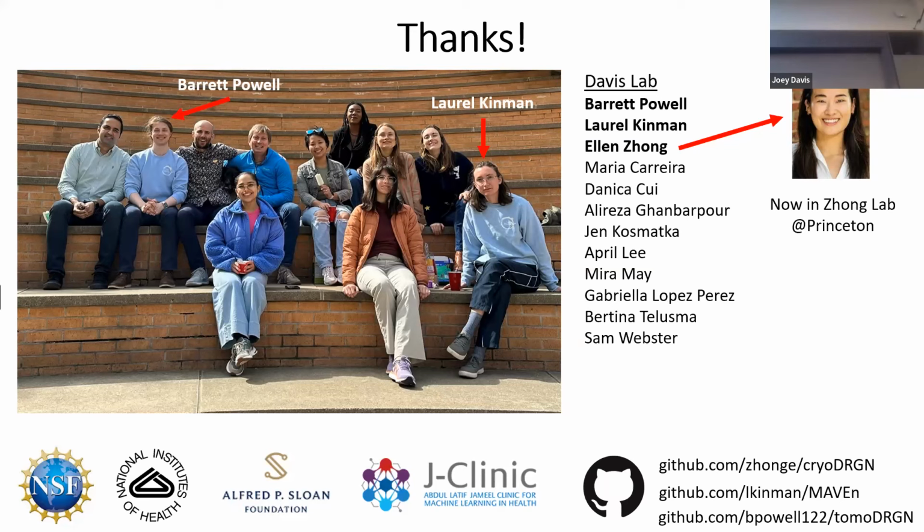Yeah, I don't know if you're a reviewer too, but reviewer 2 asked a very similar question. It is in the supplement of the NSMB paper. I got that question and I was like, oh God, this is going to derail this whole paper. And then we did 3 replicates with 3 random seeds. There were some inversions of an axis, but otherwise they were superimposable. Very surprising how that was. Well, it was a very thoughtful review.